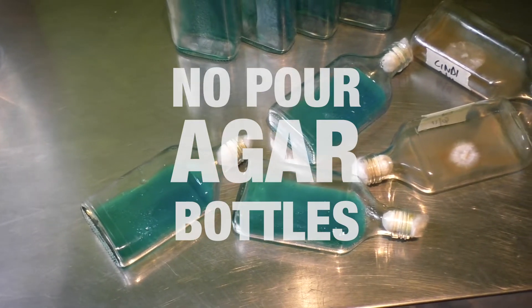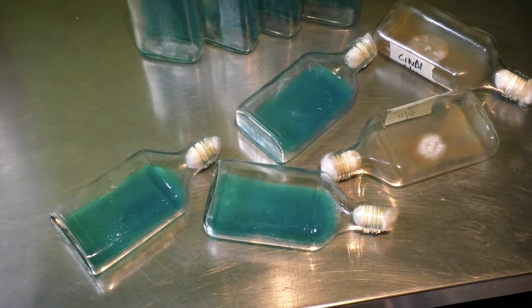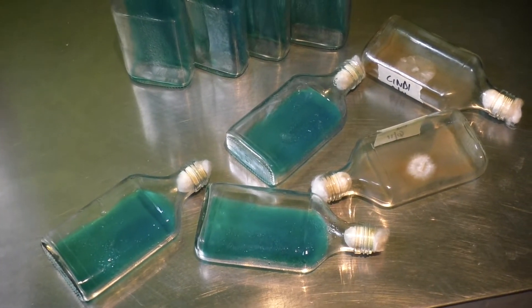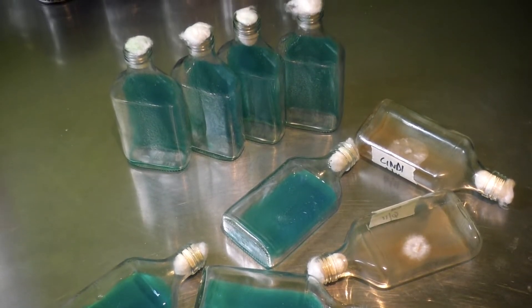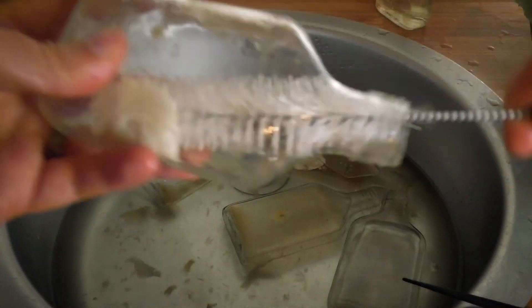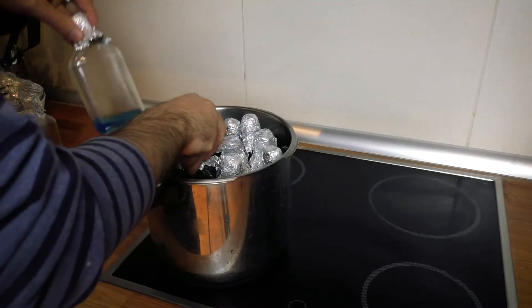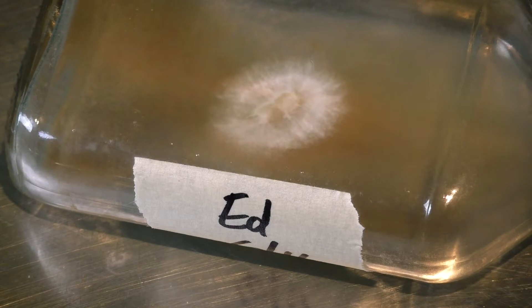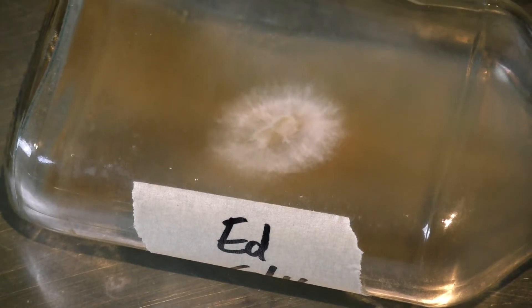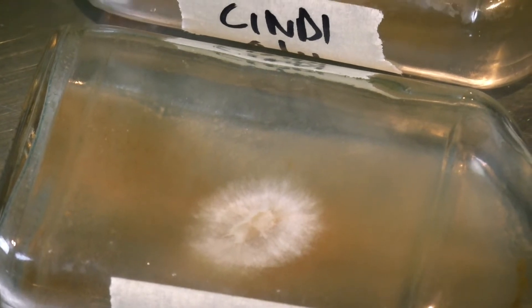Using glass bottles for agar work as an alternative to petri dishes has a number of advantages and disadvantages and I wanted to run through a few of those. I'll go through cleaning, filling, sterilizing, and working with these bottles. This is a technique that's popular in Asia but I've seen very little about it on European or American YouTube, so I thought it would be worth making a video.